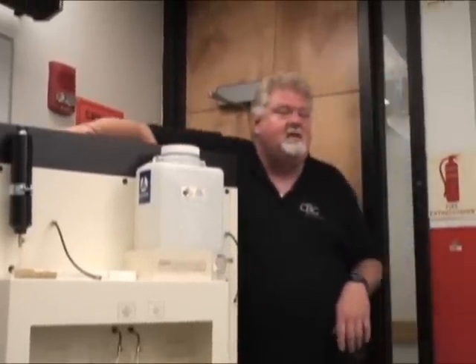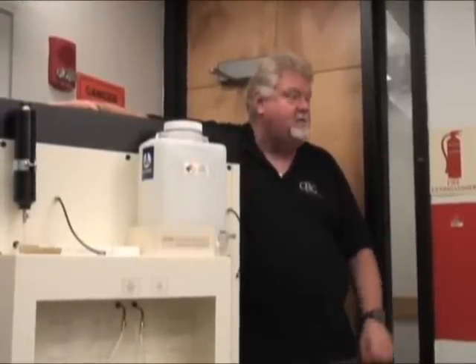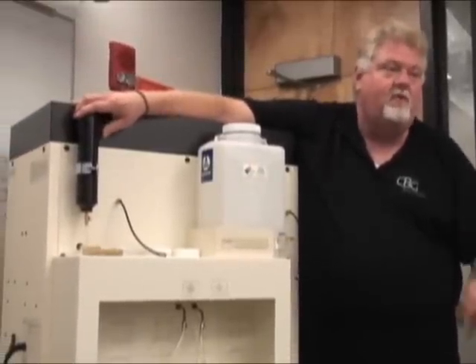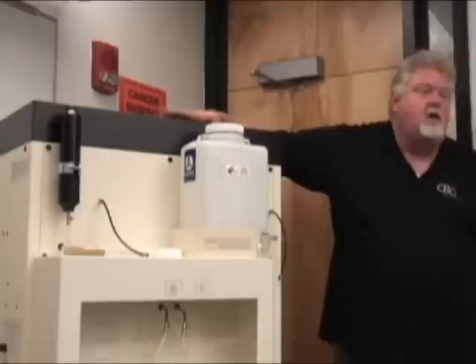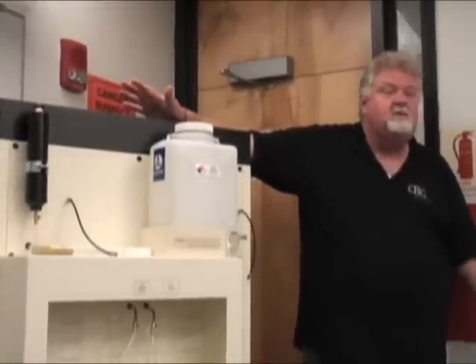What we are showing you today is a two and a half gallon solvent recycler. This unit is totally self-contained, there are no vapors or rotors. A charcoal filter mounted on the side panel lasts for two full years, and it's a $30 item. You can place this unit just about anywhere you want to — you don't need a special room, no special ventilation.